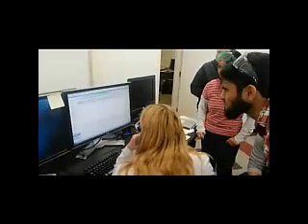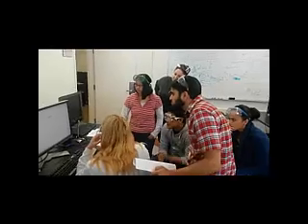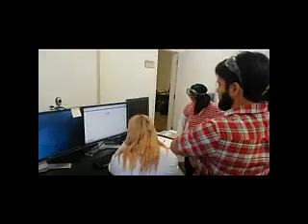Let's just save the file. Let's say this was your file. The way you would save it is to go here to print and print into Adobe PDF. You can print it to the desktop or wherever, and this computer you're logging into has internet, so you can sign in and email it to yourself. That's for HPLC.